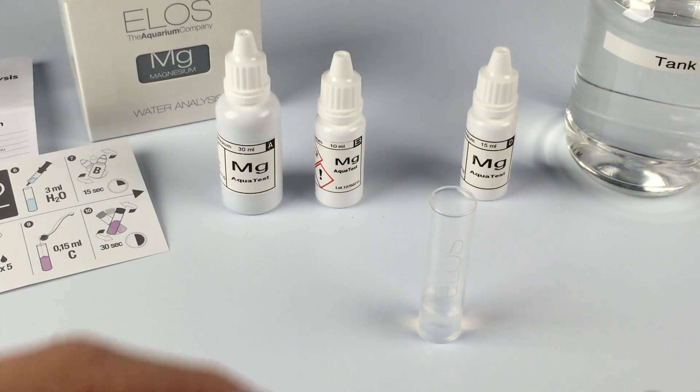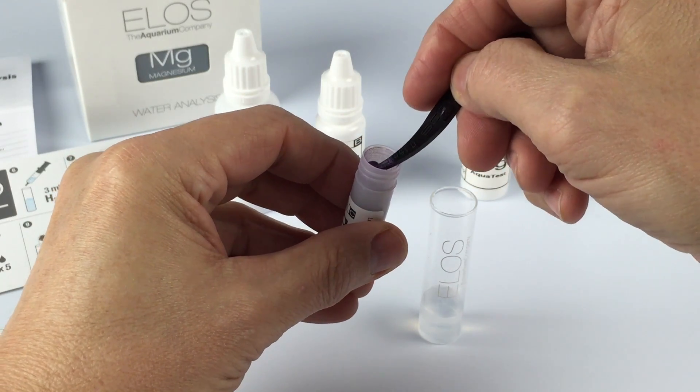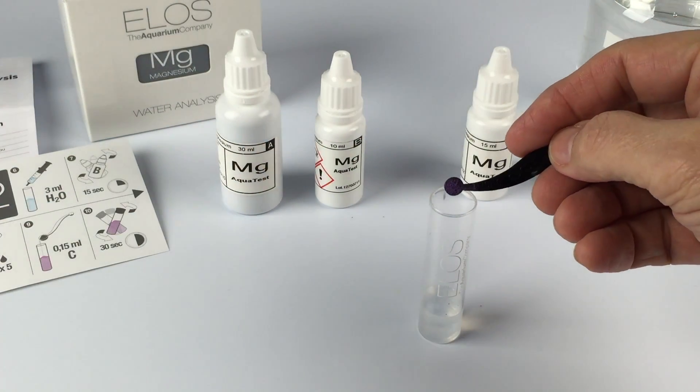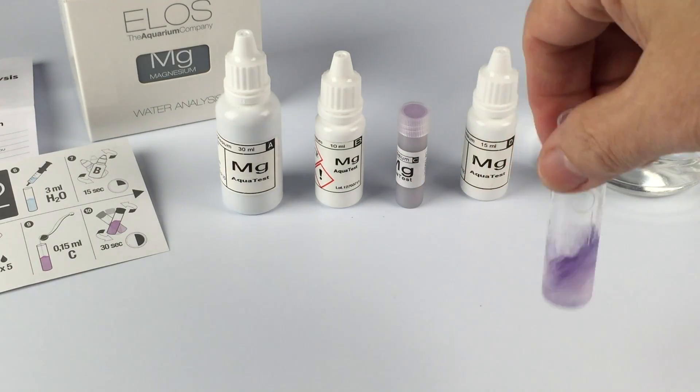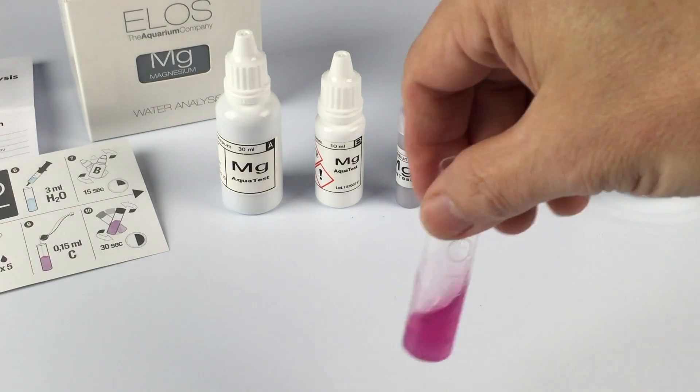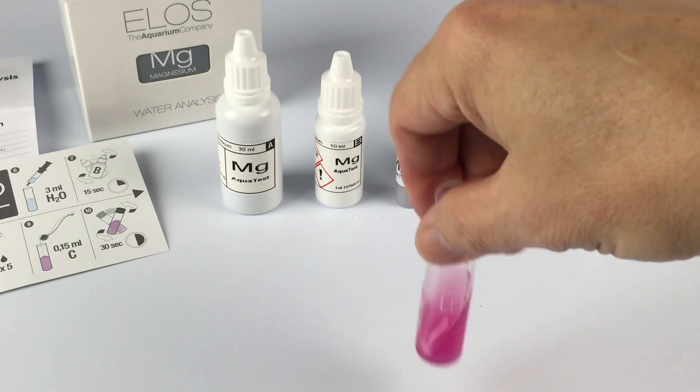Use the smaller end of the scoop, the 0.15 milliliter powder. It doesn't have to be an exact amount; this is merely a color indicator. Shake the vial for 30 seconds to mix the solution. Not all the powder has to dissolve.